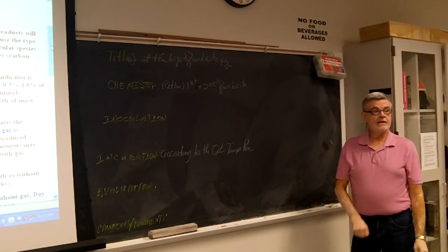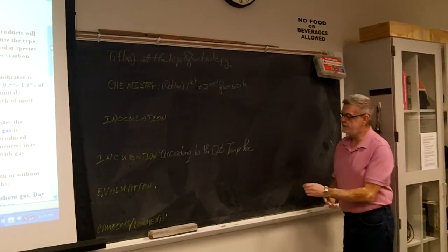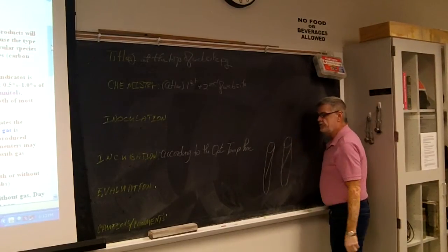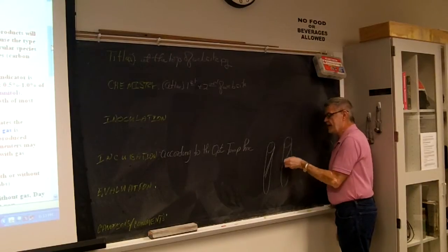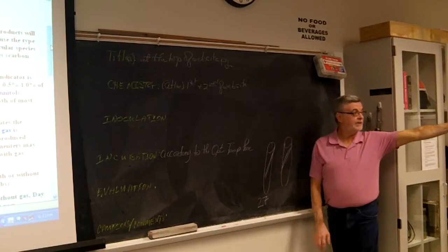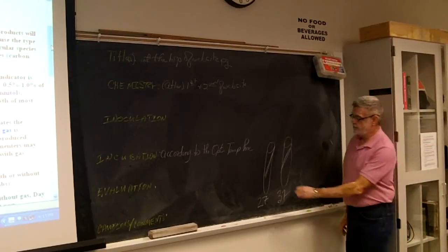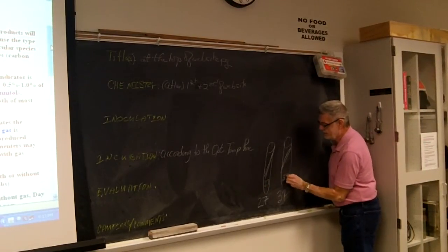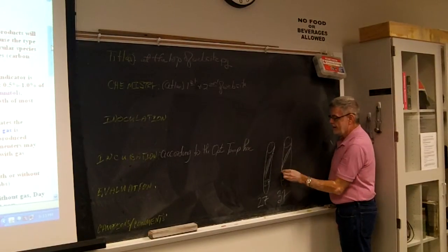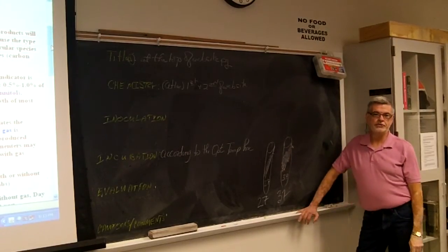All right. Now, does anybody remember the optimum temperature procedure card? It's already made up on your list, but all it is you get two nutrient agar slants, and you take a loop and you make a line. It's the only slant that you make a line on. One of them, you put in that incubator at the back that says 27. The other one, you put in overnight at 37. So you write 27 on this one, you write 37 on that one. Stick them in the incubator overnight, come back and look at them the next day, and the one that grew the most becomes your optimum temperature to run every other test.